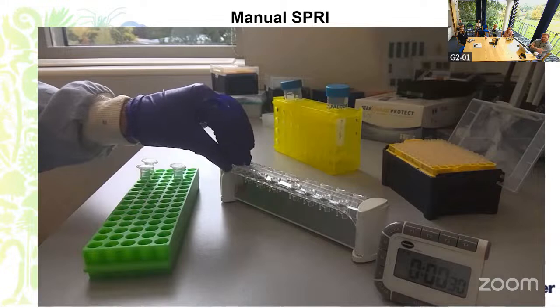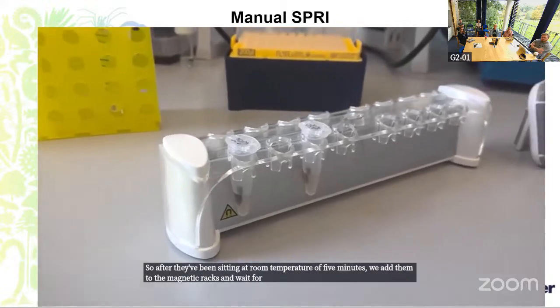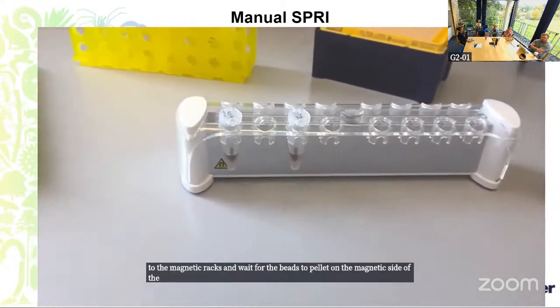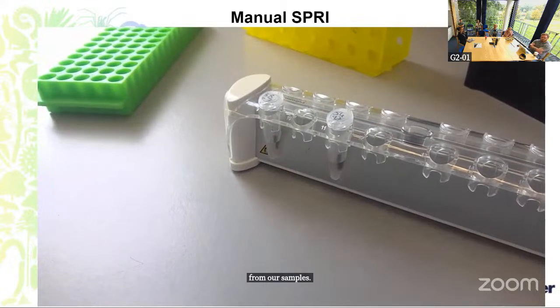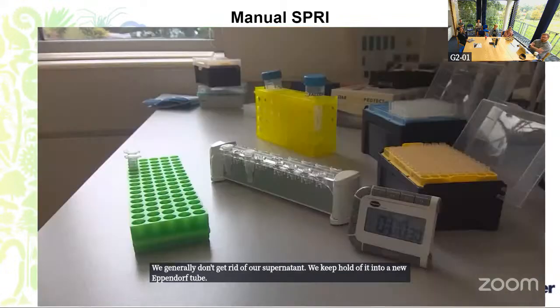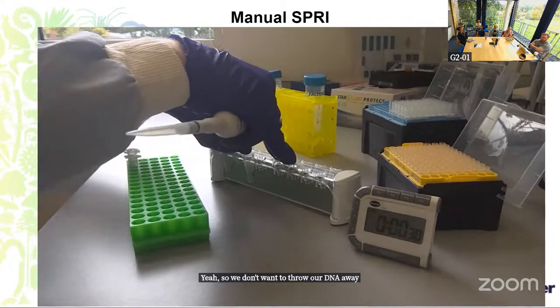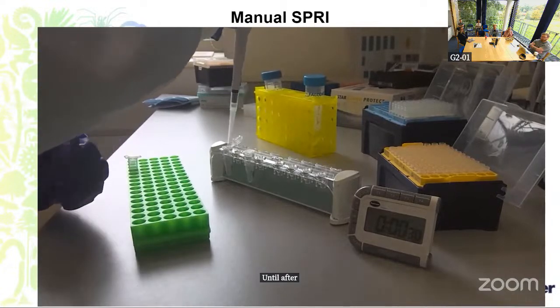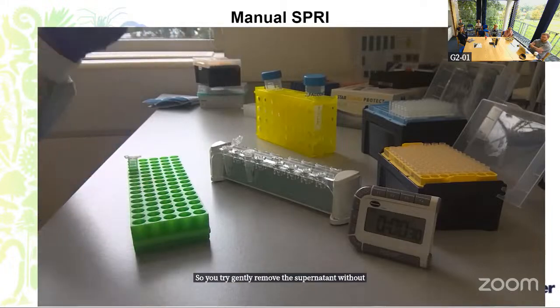After they've been sitting at room temperature for 5 minutes, we add them to the magnetic racks and wait for the beads to pellet on the magnetic side of the tube, and we can remove the supernatant from our samples. We generally don't get rid of our supernatant. We keep hold of it in a new Eppendorf tube in case the SPRI process has gone wrong, so we don't throw our DNA away. So we keep hold of it until after we do our QC. We gently remove the supernatant, trying to avoid disturbing the bead pellets.